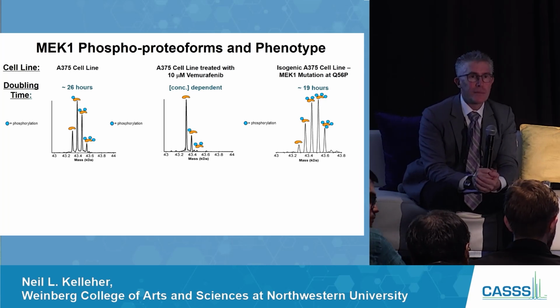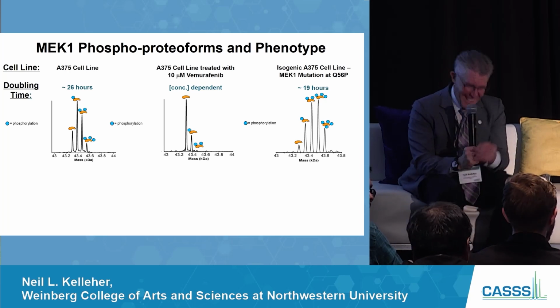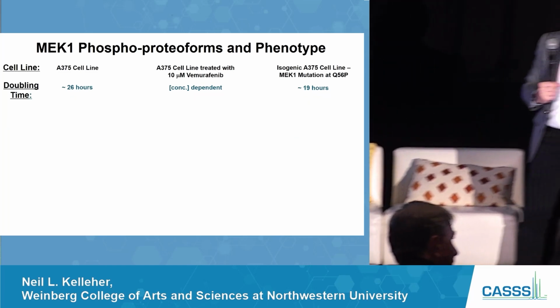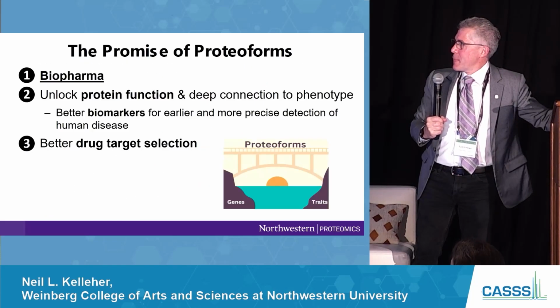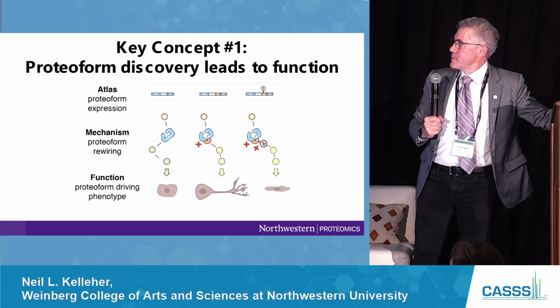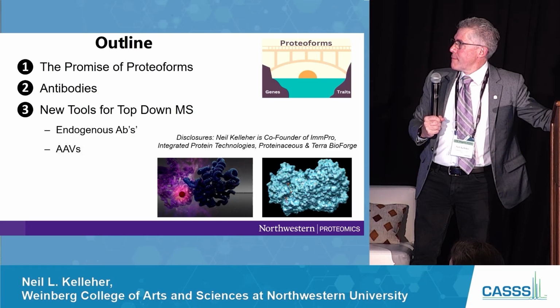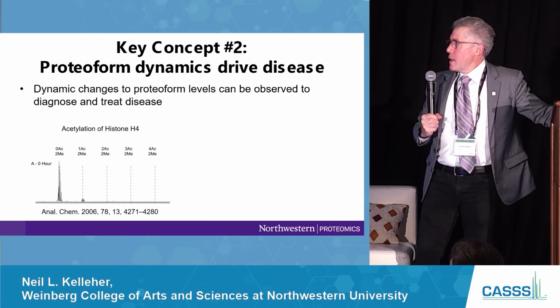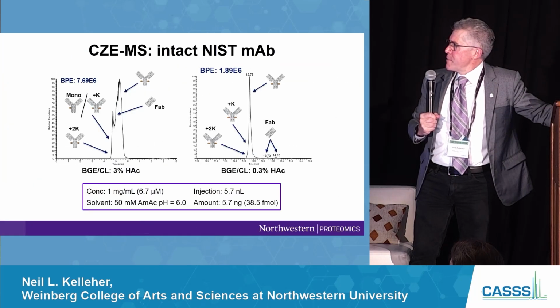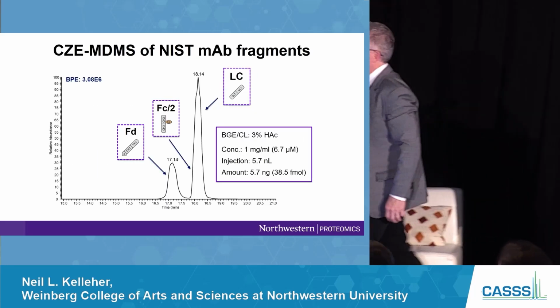Hi. As a separation scientist, it hurts to make a separation worse for the mass spec. We've seen, particularly with top-down, that the instrumentation has progressed a lot, but it is still quite slow. Do you feel like we're close to getting to a point where we can do our very efficient, very fast CE separations into a mass spectrometer and take advantage of all those top-down fragmentation techniques? Yes, that's a great question. Make it faster, and it's not. So, where's that peak going? There it is. Yeah, detune that, right? Yeah, great.